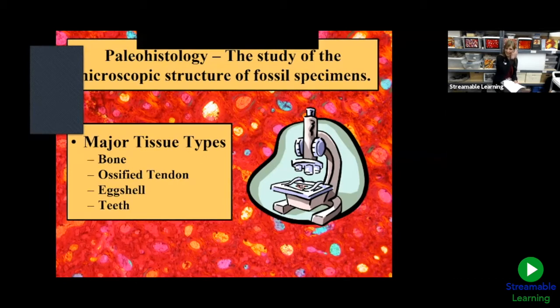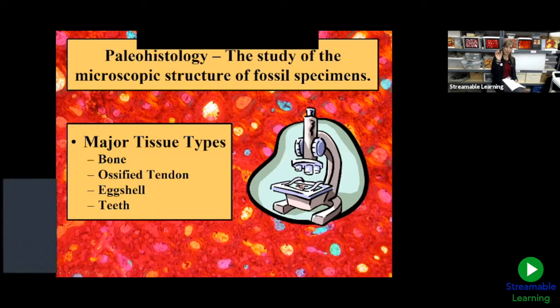Yes. And the one that jumps out at me is the stability one. It really enables us to keep the very thin starting wafer small enough that we won't be grinding and polishing forever, and in one piece when it's embedded in resin. If we were to try to cut unembedded bone that thin, we would have many sections instead of just one wafer.